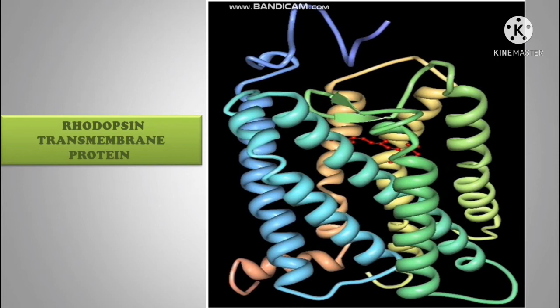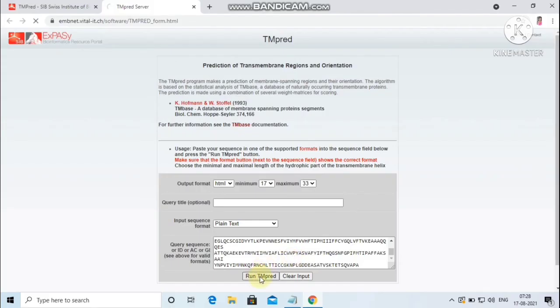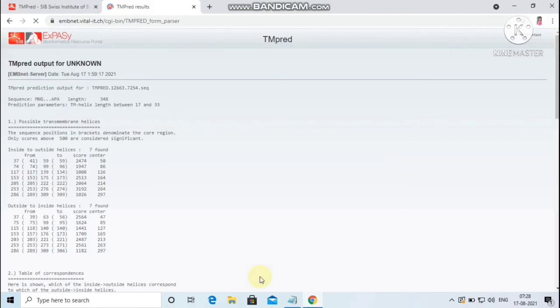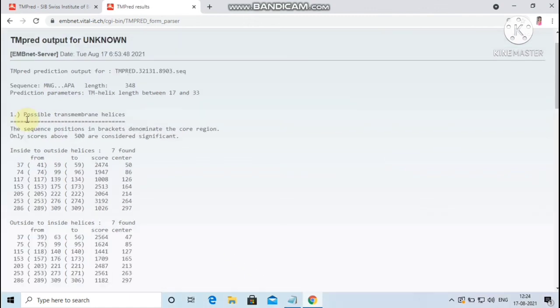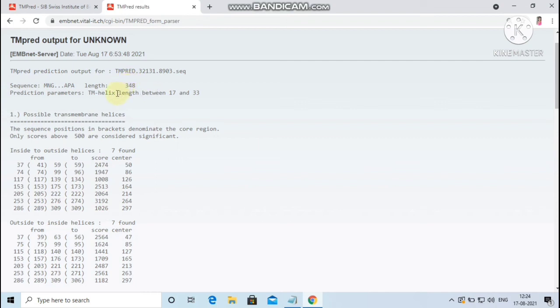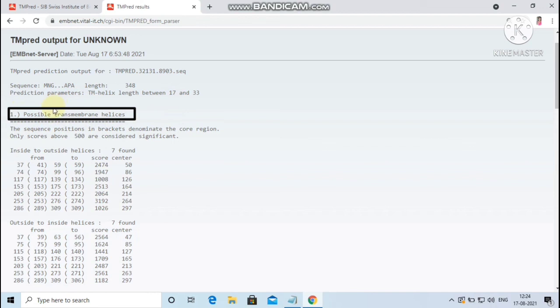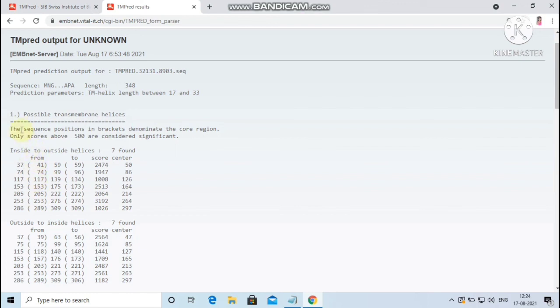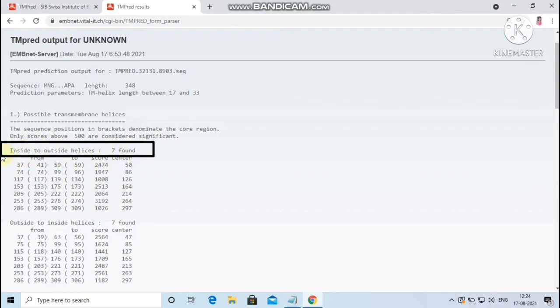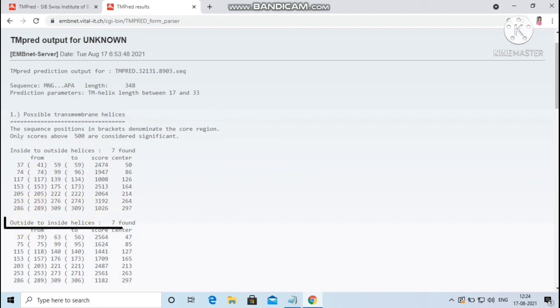Rhodopsin is a visual pigment of the rod photoreceptor cell in the vertebrate retina. Click on Run TMpred. The output page will be displayed. Here the sequence length is 348. The parameters are predicted for hydrophobic region of TM helices between the length 17 and 33. The first resultant output shows the possible transmembrane helices. The sequence positions in brackets denominate the core region. The scores only above 500 are considered to be significant. Here 7 inside to outside helices are found to be significant and 7 outside to inside helices are found to be significant.